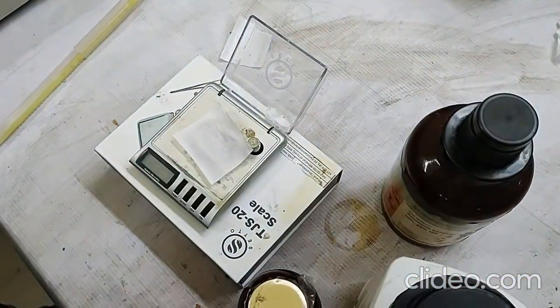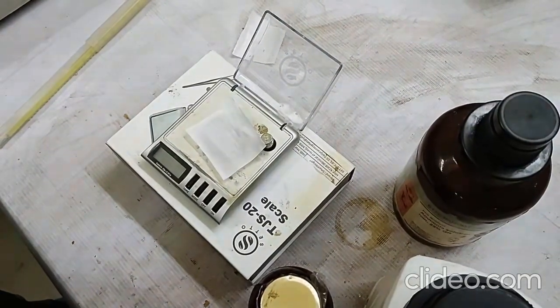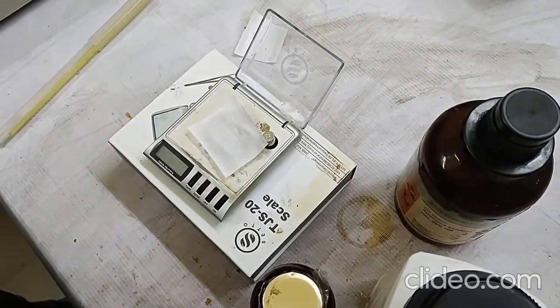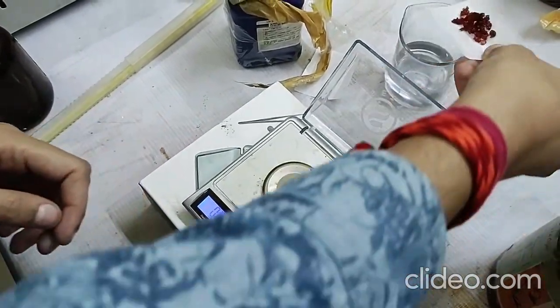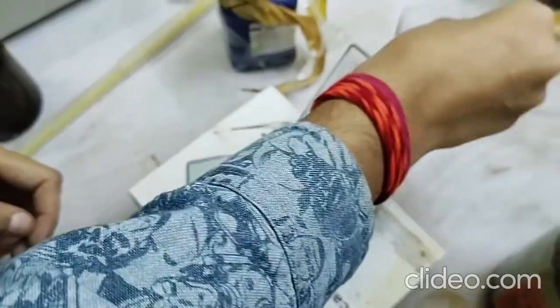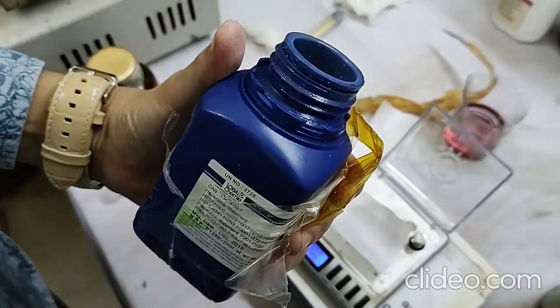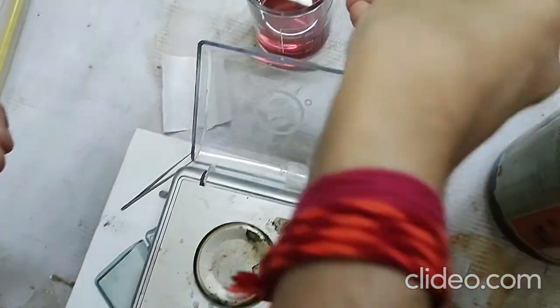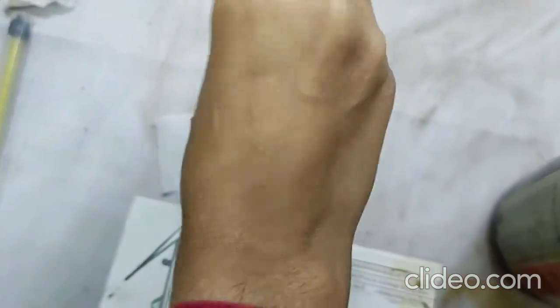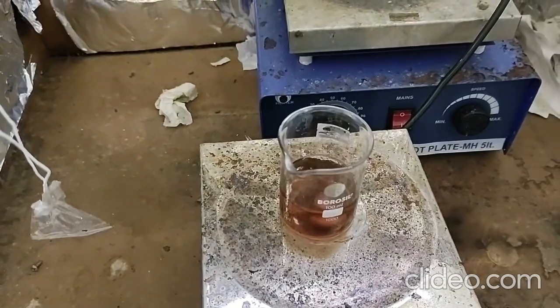First we have to measure these samples in an appropriate manner. First we take 1.5 gram cobalt nitrate and it is added to the water solution. Now we take 0.75 gram nickel nitrate. Next this nickel nitrate sample is poured into that solution. Next the mixture is stirred for another 1 hour.